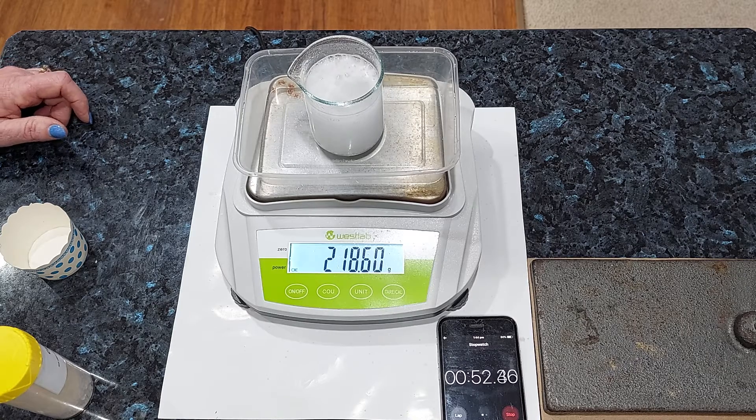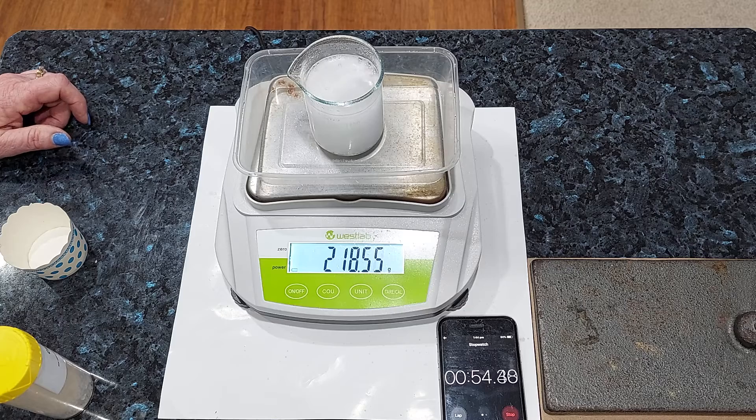Ready to take that one minute mark reading. Three, two, one — 8.84.